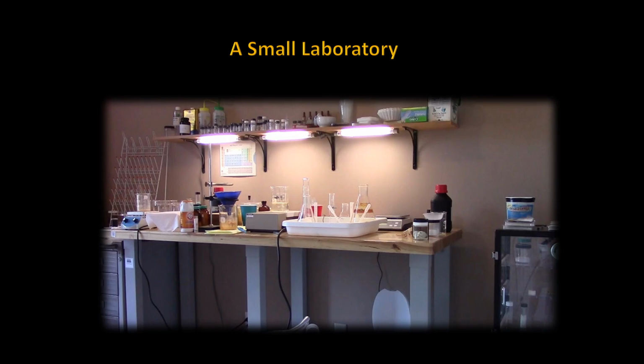Mining companies build laboratories on site, as smaller labs do not require large amounts of real estate, only small physical spaces. This would be a benefit for a small operator or a prospector, even a hobbyist. A small form of a lab can be assembled on site, even in your garage or basement. Always remember safety and ensure adequate ventilation.